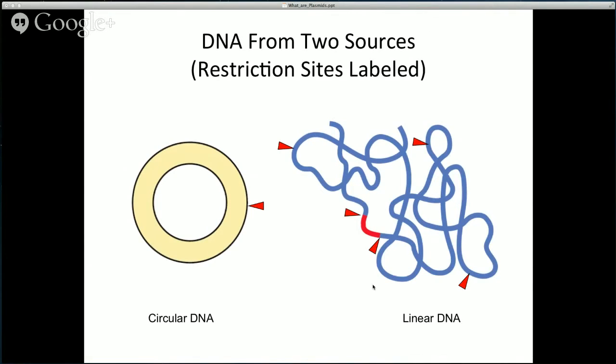So in Lab 7, what you're looking at, the GFP plates, basically what they did was they took two plasmids. You had one plasmid that had the green fluorescent protein, and then you had another plasmid that had a promoter site for the green fluorescent protein, and it also had an ampicillin resistance gene.